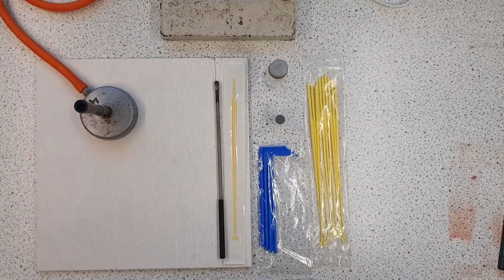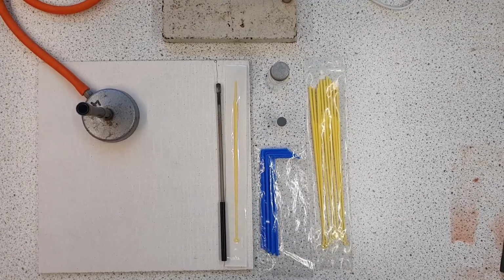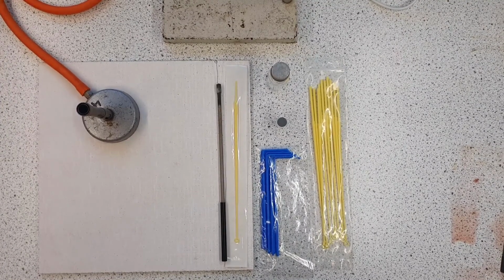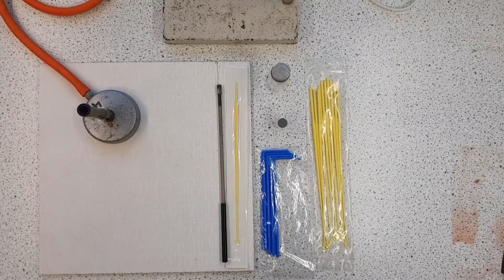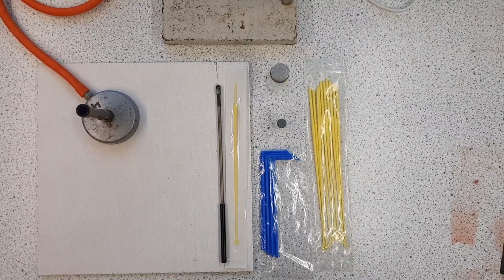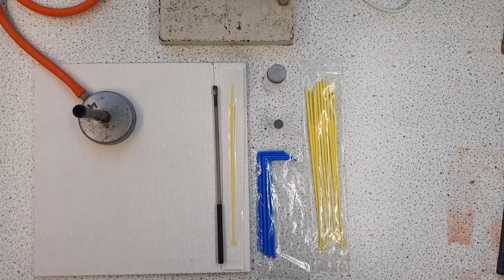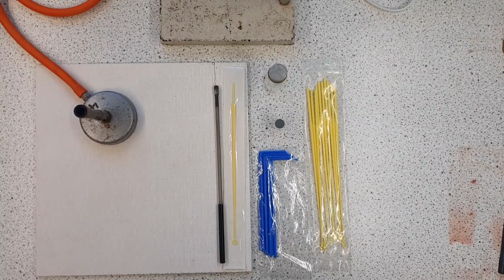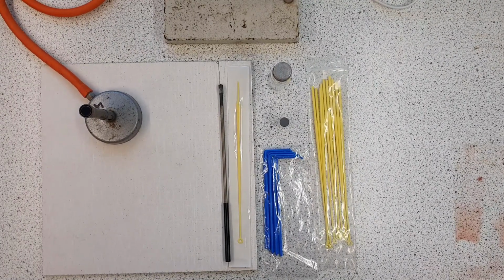Okay everybody, so today we're going to be doing required practical 6, which is a microbiology related practical, and as you might be able to guess, it's quite a safety oriented practical. As part of that, I'm just going to be going over some principles of aseptic technique with you all. Aseptic technique is a collection of techniques and methods by which we attempt to reduce the chances of contamination, both of ourselves and of the media that we're using.